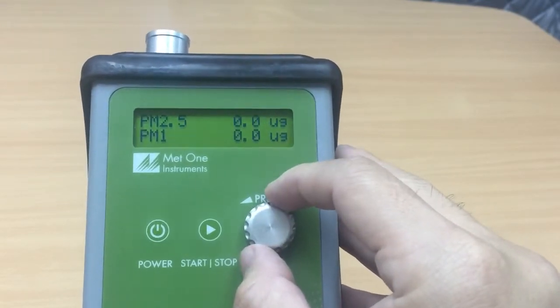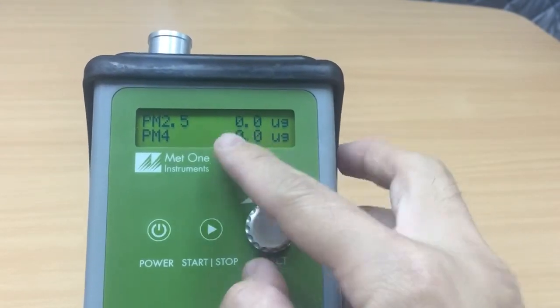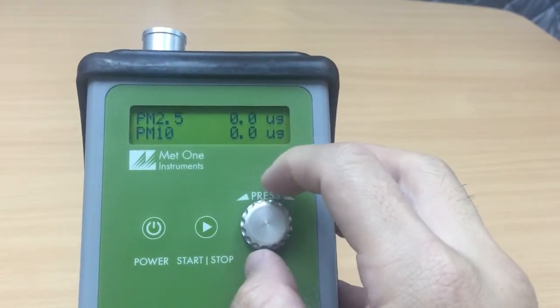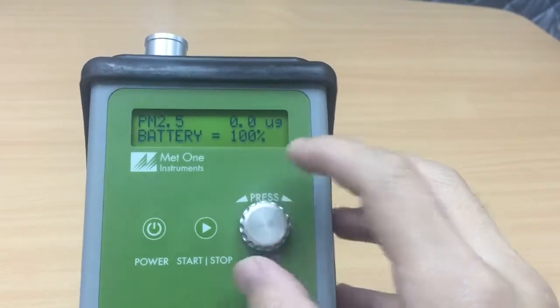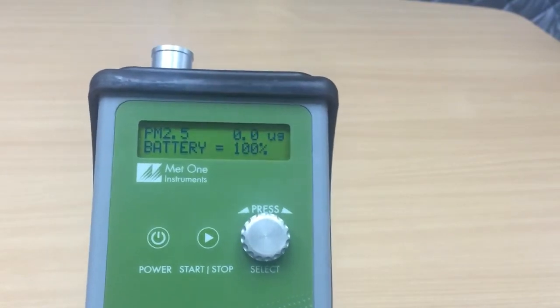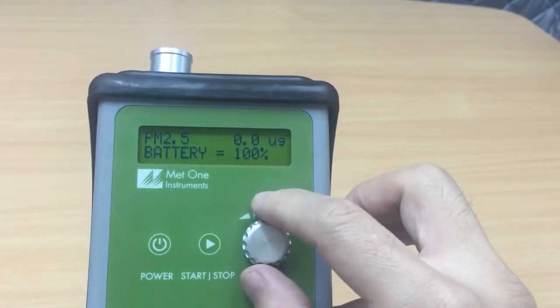So the instrument does measurements for PM1, PM2.5 of course it's being shown already, PM4 and PM10. So 1, 2, 3, 4, four different particle size sections. Battery right now is 100% as we have indicated.